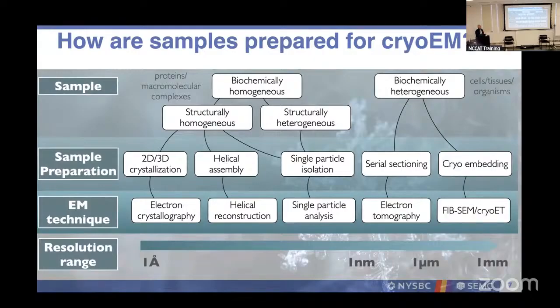That's why in terms of other structural sciences, it dovetails really well. If you have samples for, let's say, X-ray crystallography or NMR, they can directly enter in the left half of this pipeline.